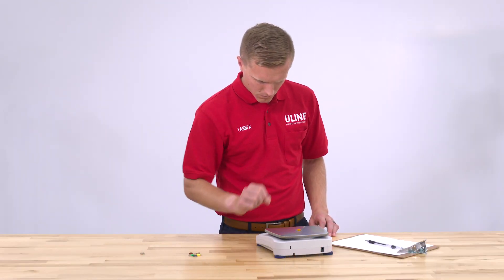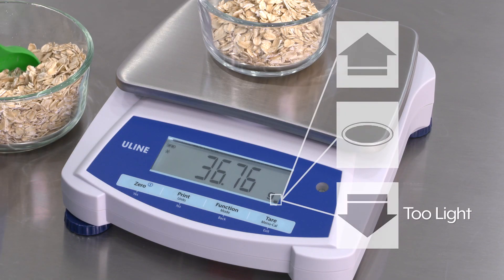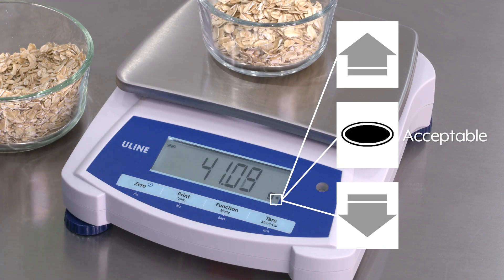This video will show you how to check weight with Uline Balance Scales. This mode sets low and high weight limits in portion control processes.